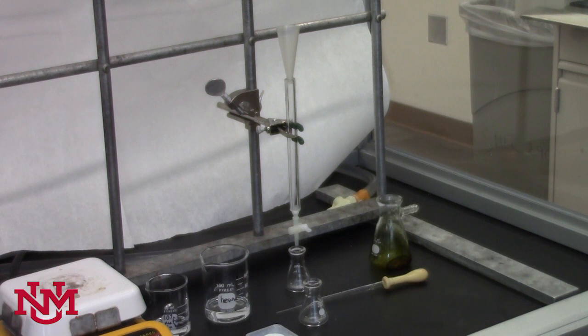Now it's time to prepare the column with the solid support that we'll use, similar to the TLC plate from last time. This time it is alumina. Last time it was silica on your TLC plate.